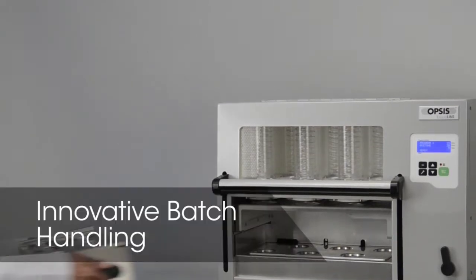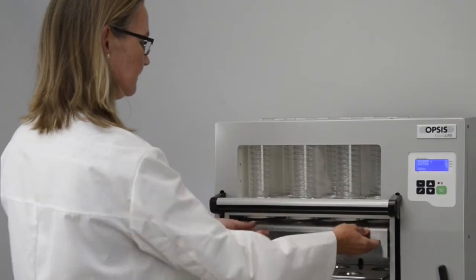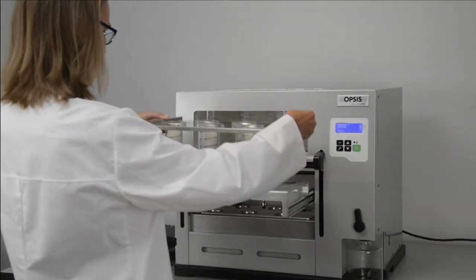Batch handling of samples can significantly reduce the time spent with solvent extraction. The Soxrock introduces a new innovative batch handling approach.